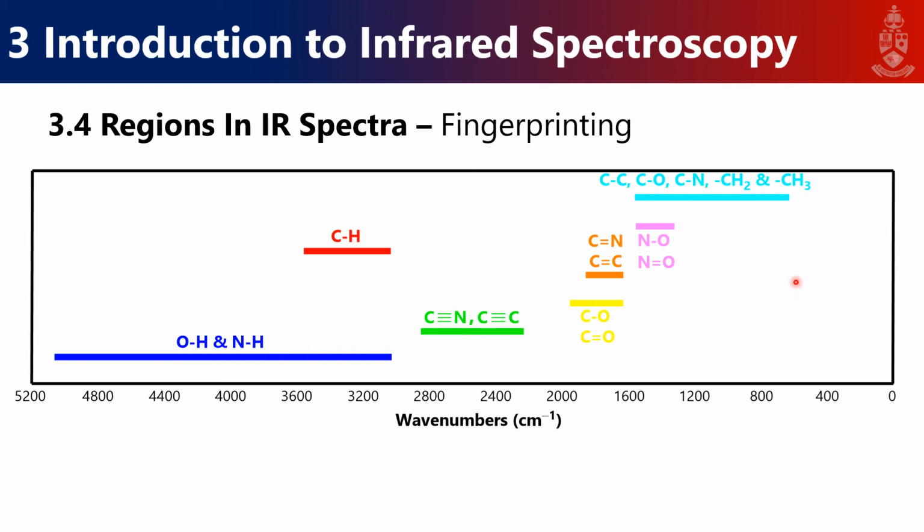If one of them has exactly the same spectrum, set of peaks here at the beginning, between 450 and 1450, then you might start asking, do you actually have perhaps a mixture of products, or what's going on there?